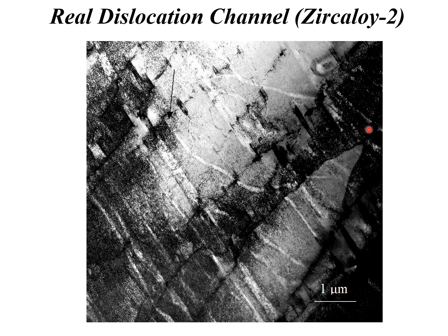No misunderstanding here. These are dislocation channels. I don't have the extra image I would have put on here. The characteristic of dislocation channels is that they contain dislocations, and the edges are not sharp like a twin would be. They don't have sharp edges because of the dislocations.